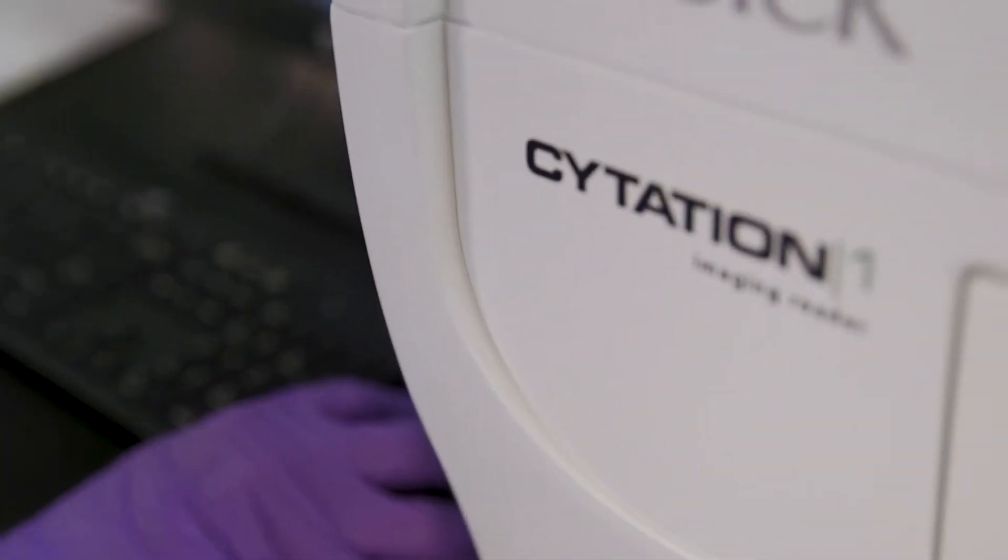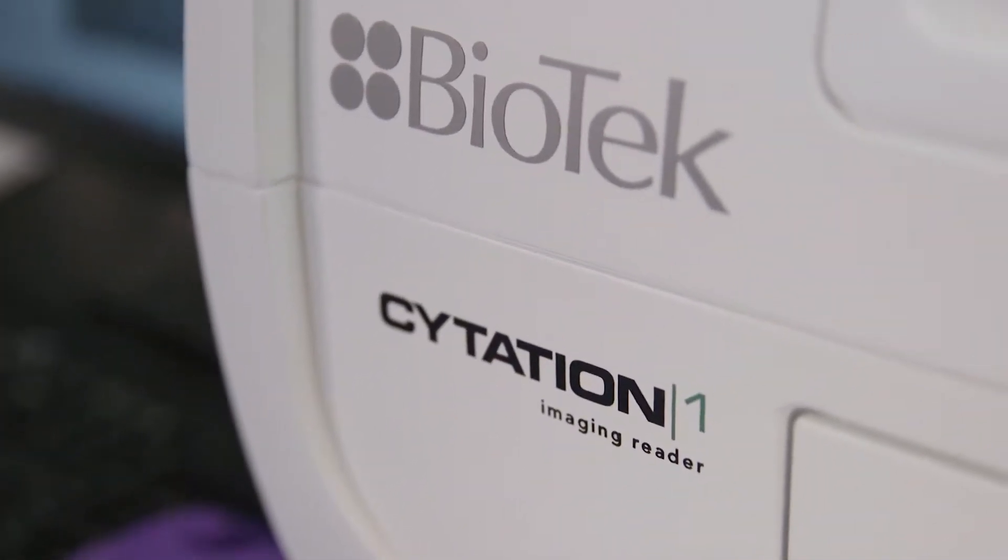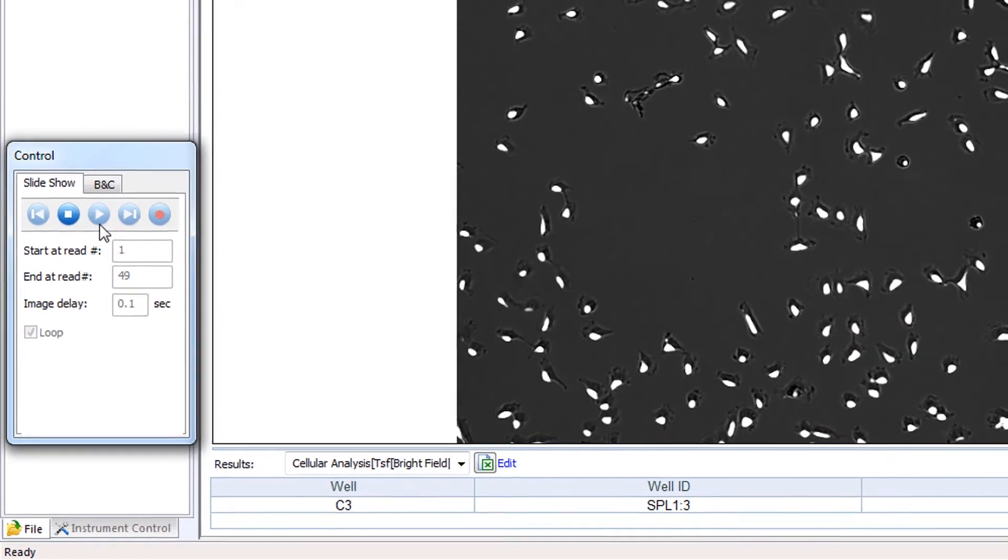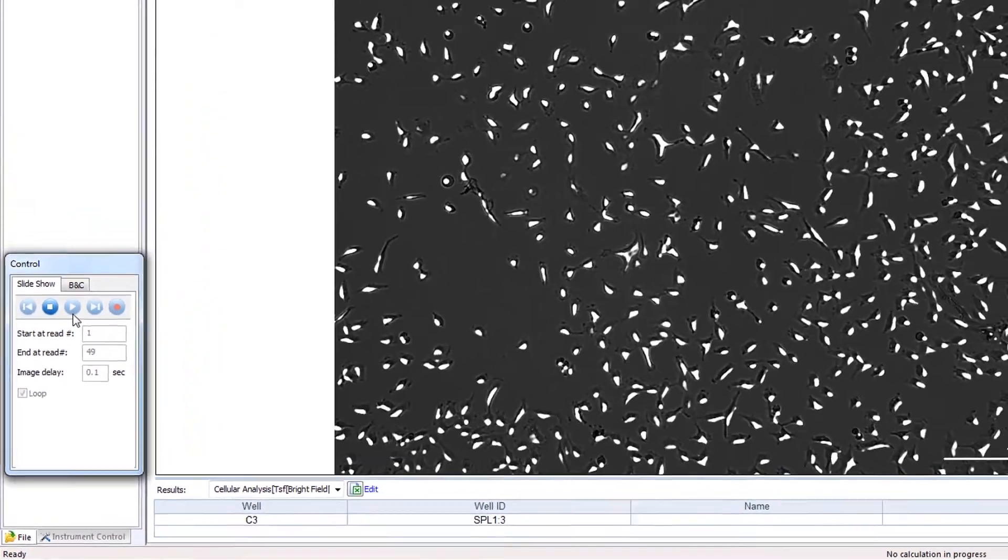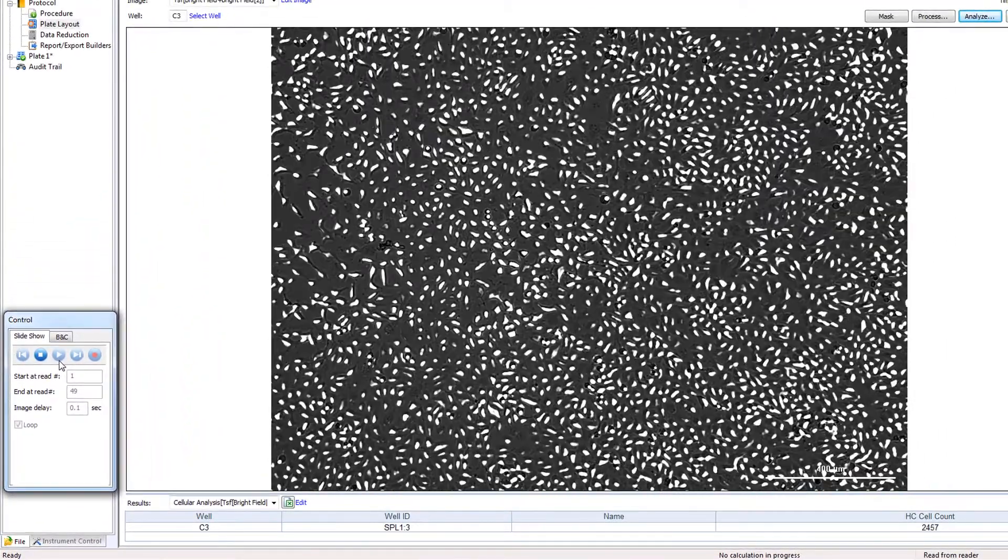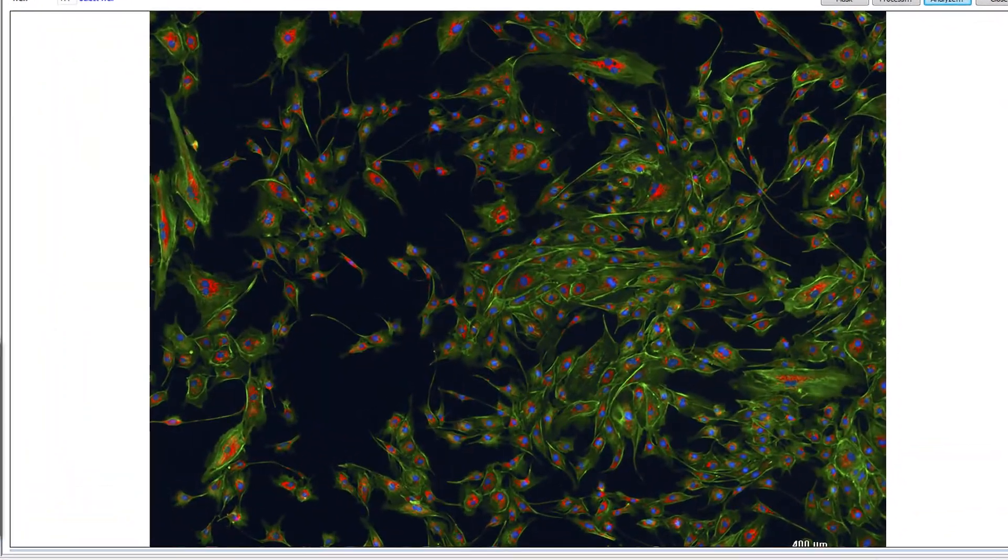Biotech's Citation One Cell Imaging Multimode Reader is an ideal platform for automated cell counting using microscopy methods such as label-free brightfield and fluorescence cell counting.